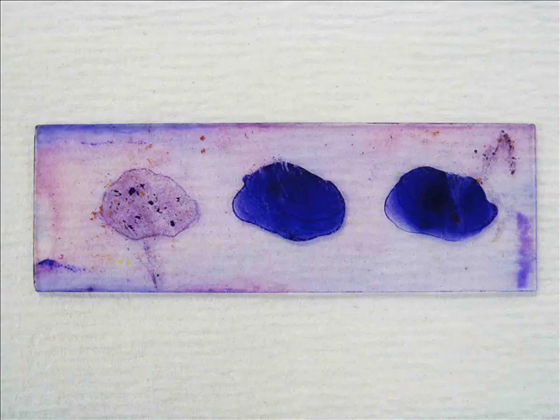Here's an example of another similar slide, but my acid fast control on the left is a little more visible and I do see a circle of color.